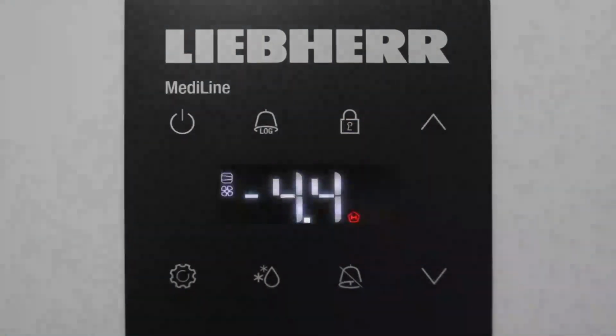Liebherr Biomedical support videos, professional series settings adjustments. This video is to show how to adjust the common settings that you may wish to adjust on your appliance.